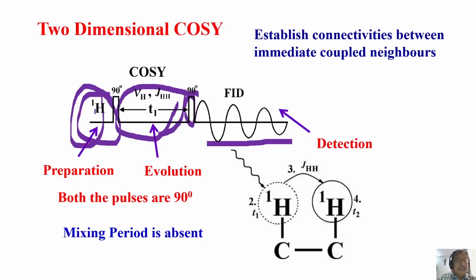We are preparing the spin system. What do you mean by preparing the spin system? In this type of experiment, you want to make sure nuclear spins attain thermal equilibrium. Put the sample in a magnetic field. Wait for some time, a few seconds, and spins start aligning in the direction of the field or in the direction opposite to the magnetic field. Based on the Boltzmann population distribution, they get aligned. Very simple, and we prepare the sample.